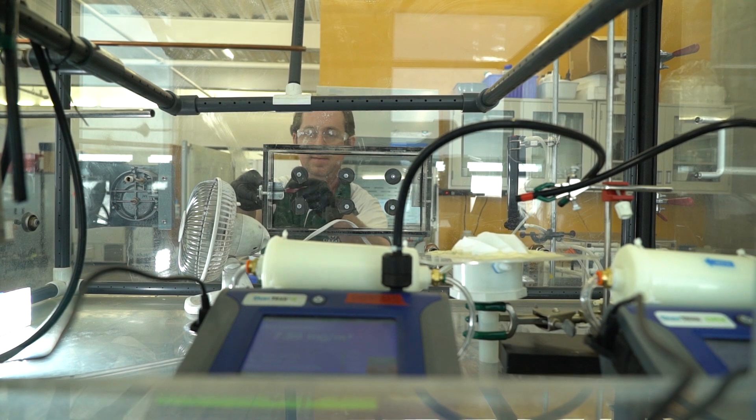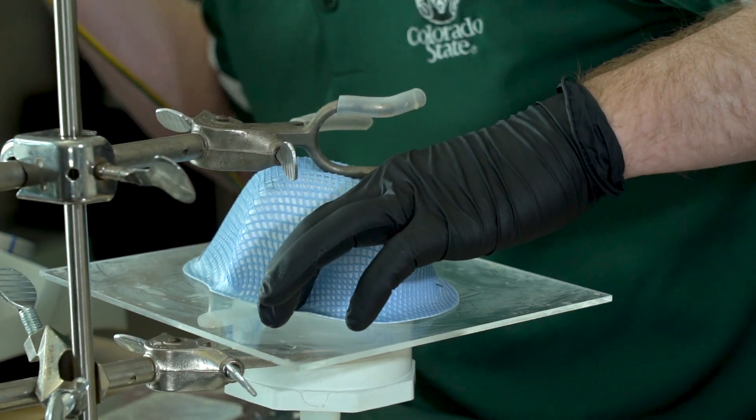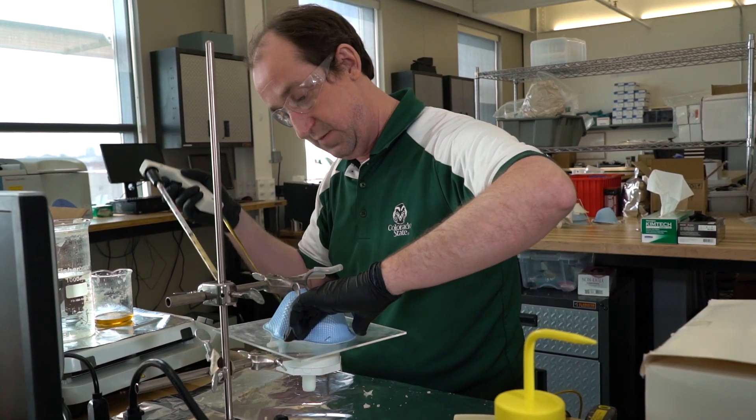Right now we're focusing whenever possible on N95 methodology and testing of N95 masks. They're the first priority for the state.